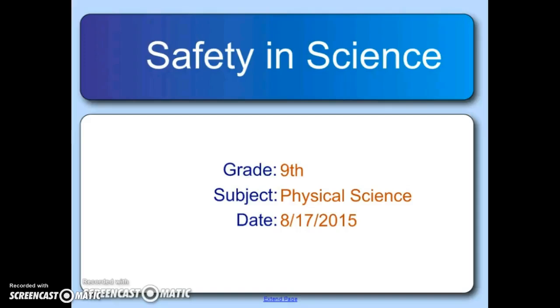Alright, this is our first video. This video is about safety in science. Specifically, we're going to talk about two things. The first one is understanding chemical hazard labels, and the second thing is MSDS, Material Safety Data Sheets.